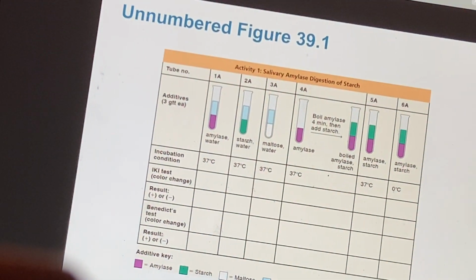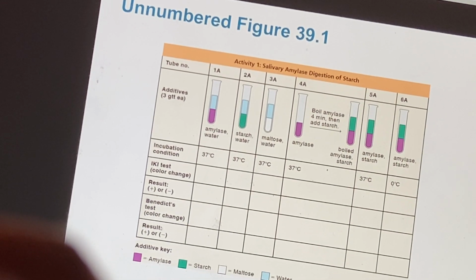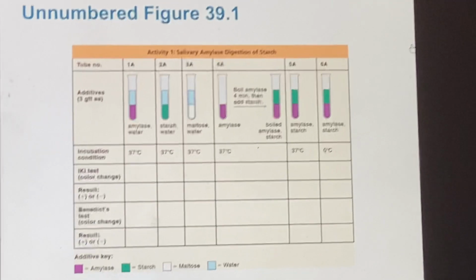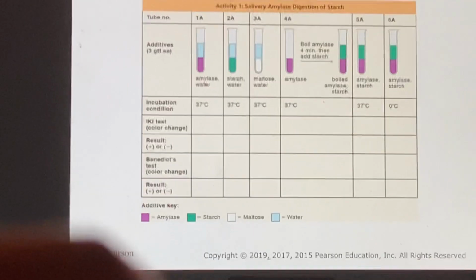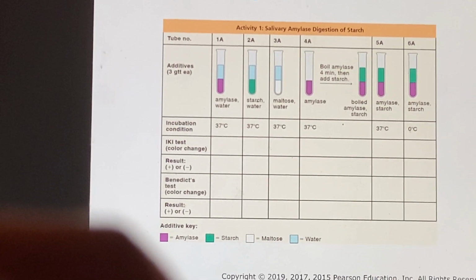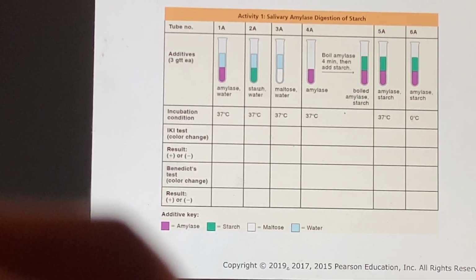But we will presume that the materials here are freshly made. This is just to identify how the salivary amylase digests starch.